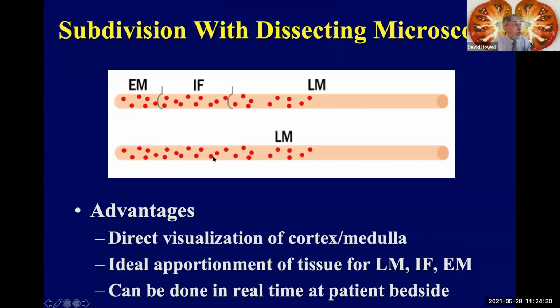So a lot of tissue for light microscopy to look for things like focal necrosis and an early pauci-immune glomerulonephritis. A sufficient amount of tissue for immunofluorescence, and then 1 little piece of tissue that's a good quality piece with glomeruli in it. So the EM lab ideally only has to do 1 block.